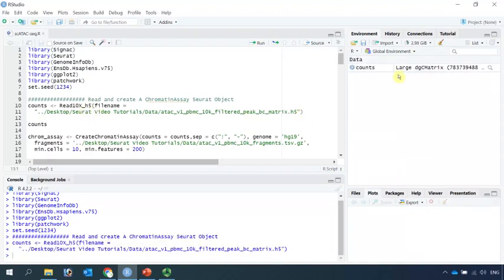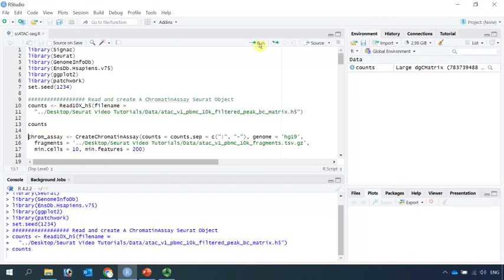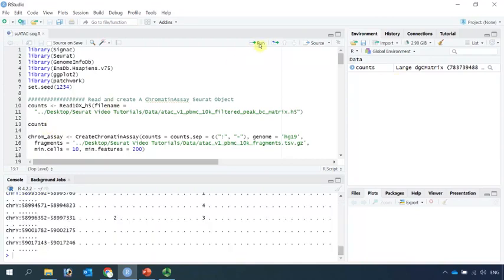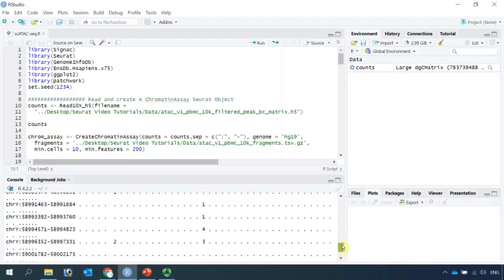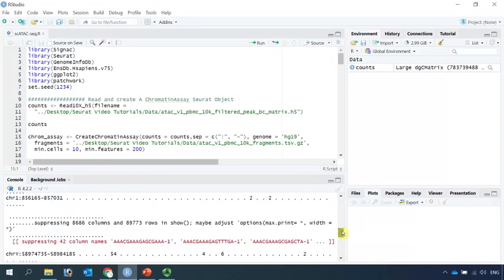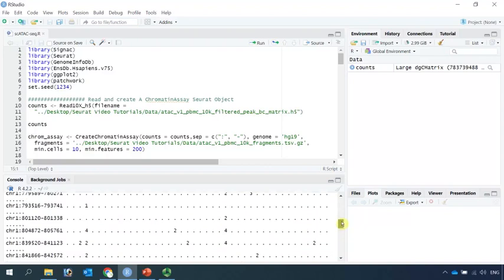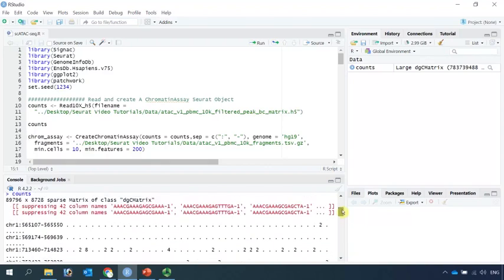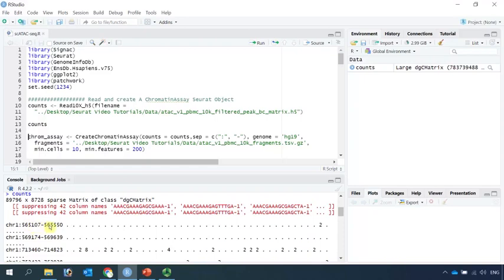You can see we have the counts data here. It is a large dgCMatrix data. Let's have a look at the counts. You can see the column names are cell barcodes. The row names are peaks. It shows which chromosome and the start and the end position of next fragment. The value in the counts represents TN5 binding sites.